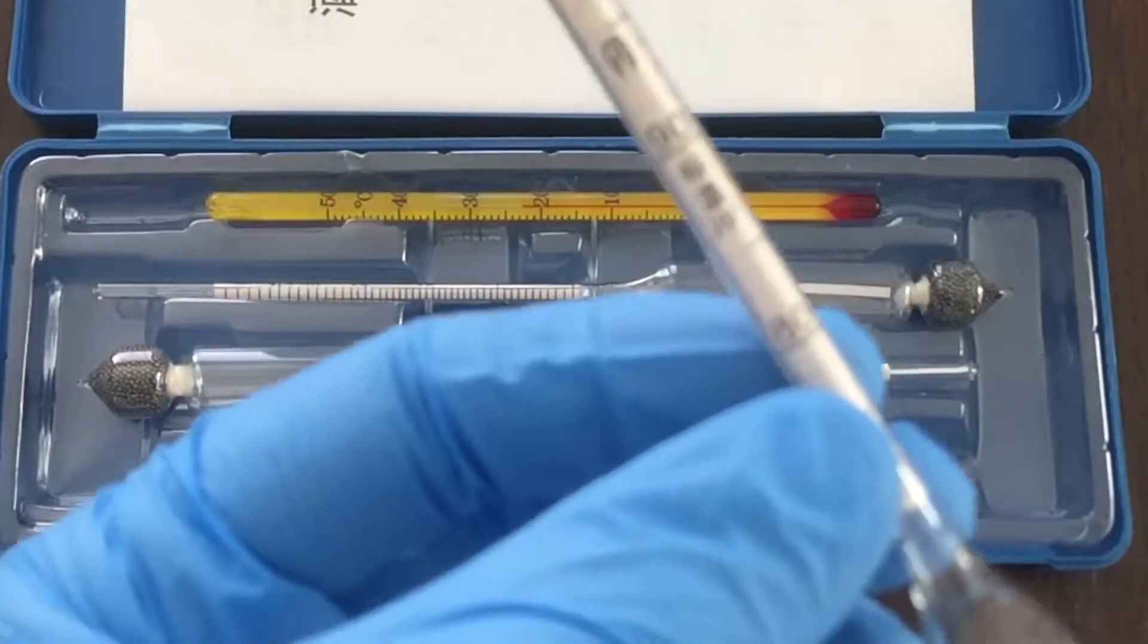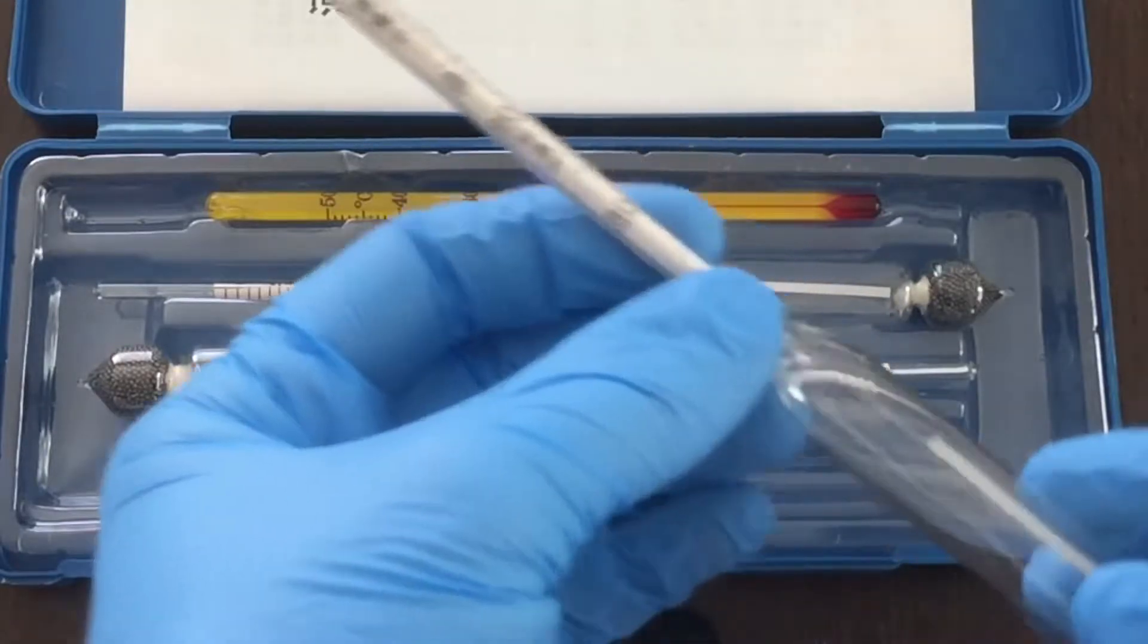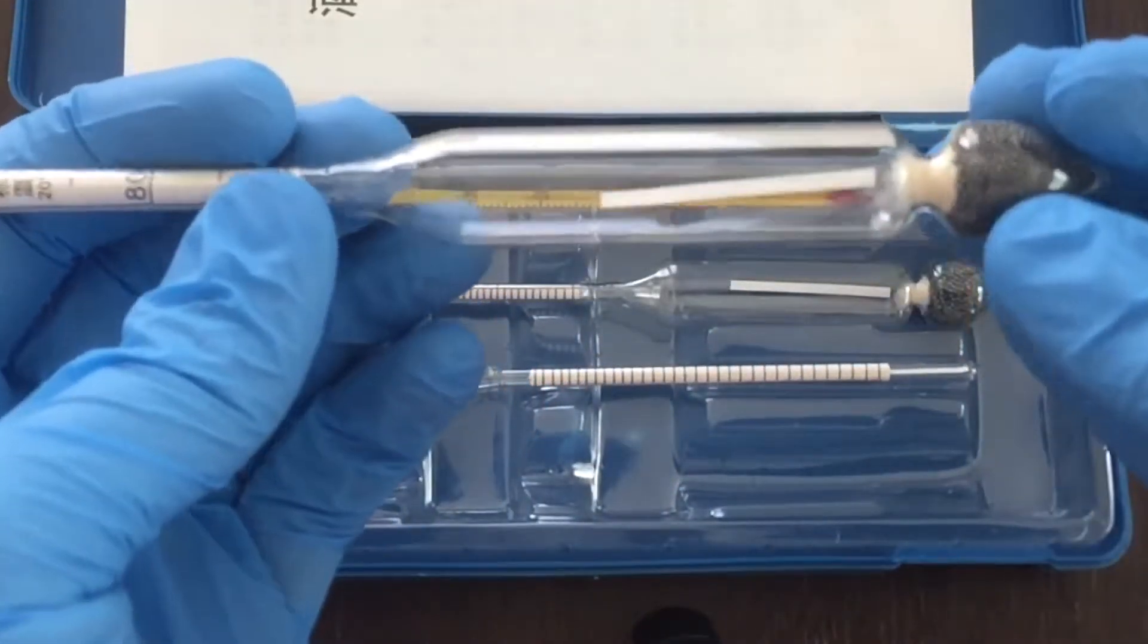For my sugar wash fermentation project I needed a way to measure the concentration of ethanol fermented and a hydrometer seemed the cheapest and simplest way to do this.